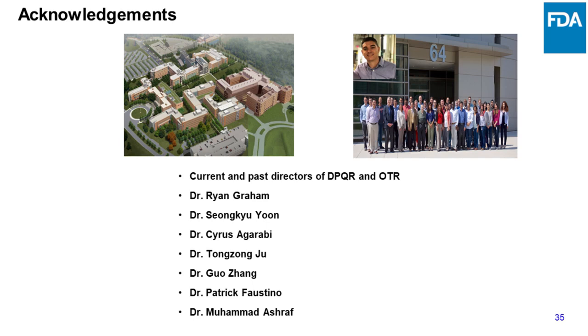So that's one aspect we have considered, and we also compared batch alone runs with fed batch. We looked at containers made of plastic versus glass, and those containing metal components versus those which do not. In future we are also interested in investigating single-use bioreactors, wherein most of the components are plastic or plastic-based with different compositions. Do they contribute anything towards either metal or metal chelation, whether it happens? Those aspects are on our radar.